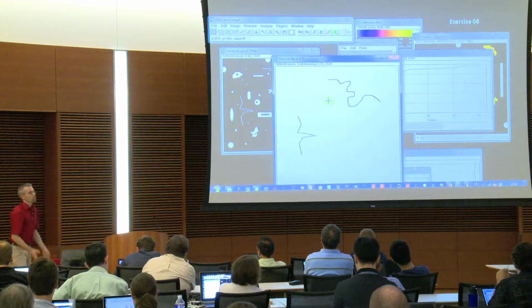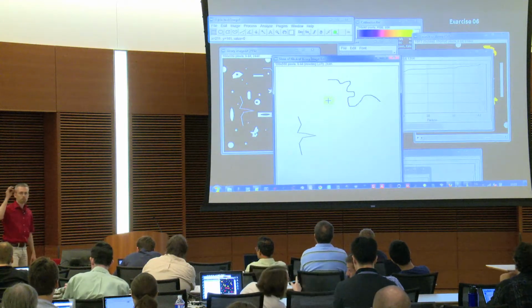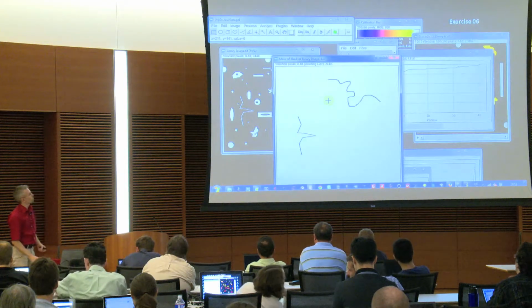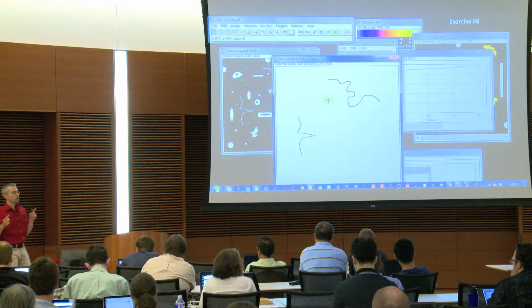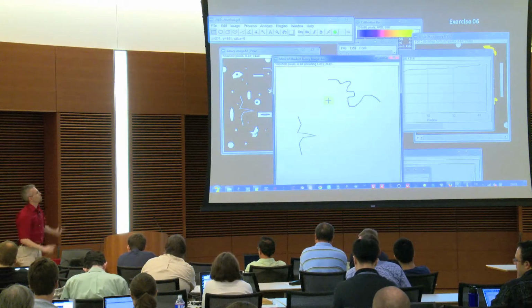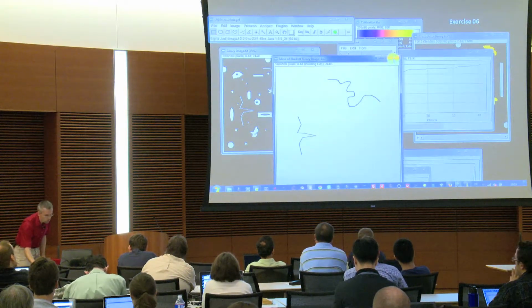So this is the one we would extract, and if you would have results table active, then you would also get the results for those ones. So this is how you can use a combination of the shape descriptor maps and the extended particle analyzers to specify it specifically to specific shapes, for example.